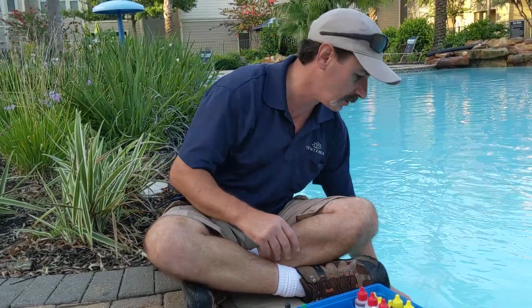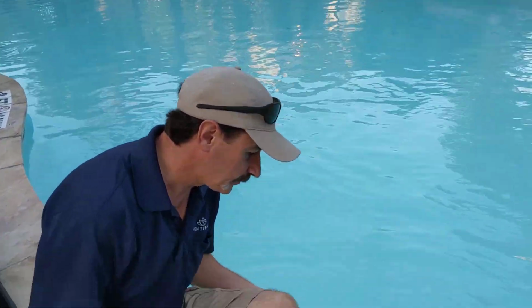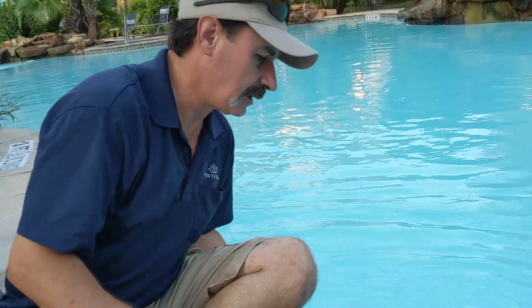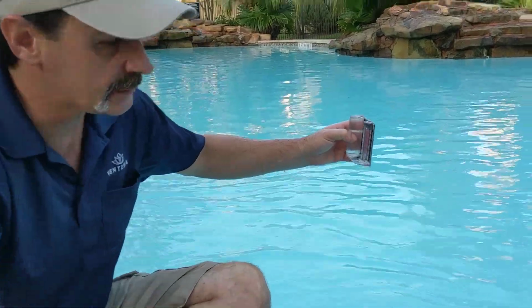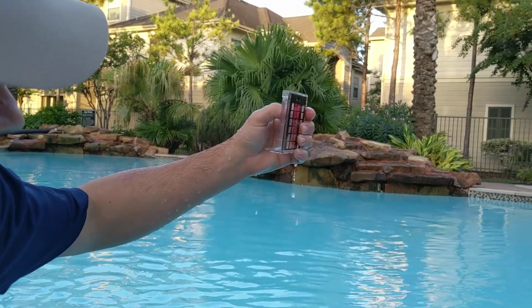So we get our vial, rinse it a few times. Then when you take your sample, you want to hold this upside down and go down deep, about elbow deep, and then turn it up. And then for the chlorine test, if you read the instructions here, it's going to tell you we're going to use the 9 milliliter vial.